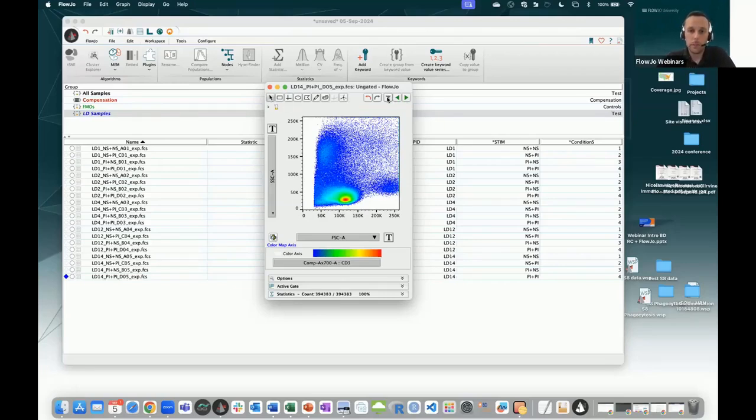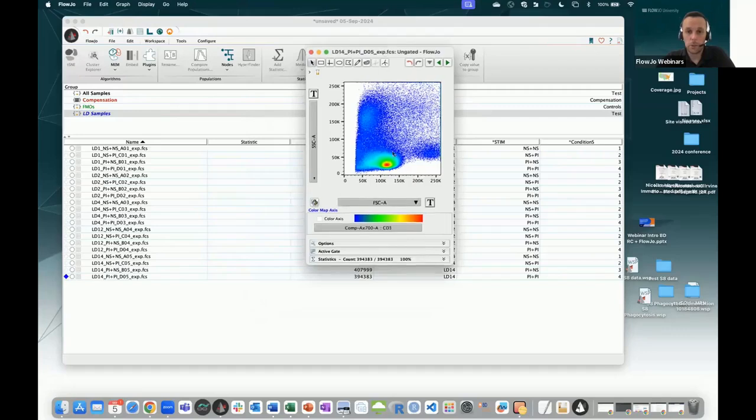You have your gating tools right here. The up and down arrows to go up and down in the analysis. Right now, we don't have anything. That's why they're grayed out. You have the undo and redo button if you need. So the default visualization in FlowJo is a pseudocolor dot plot. So here's a pseudocolor. When it's red, that means you have a lot of cells with those values. If it's blue, that's only one cell with that value.